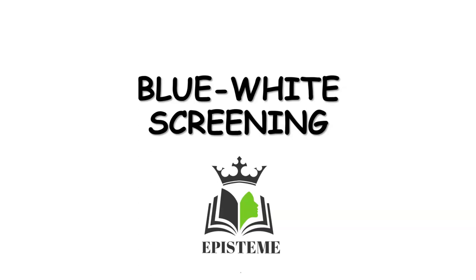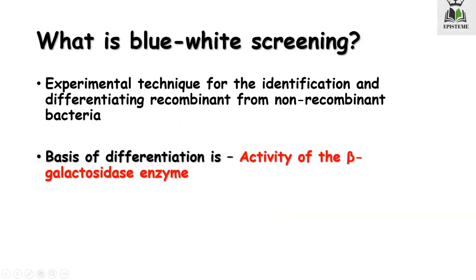Today the topic of our discussion is blue-white screening. What is blue-white screening? Blue-white screening is a laboratory or experimental technique which helps to distinguish between the recombinant plasmid containing bacteria and the non-recombinant plasmid containing bacteria. The basis of this differentiation is the activity of the beta-galactosidase enzyme. We will learn about this entire process, principle, and the concepts of every component in this video.